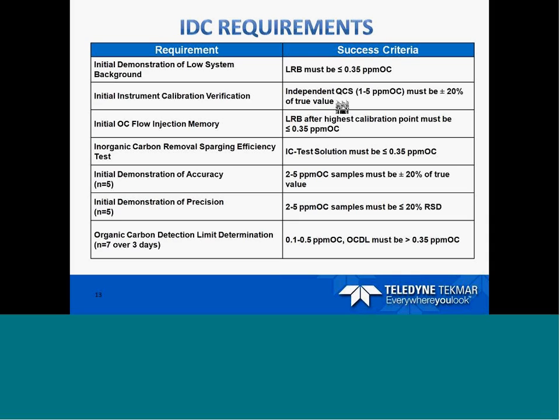We're going to get the demonstration of accuracy. We're going to look at precision, and also look at the organic carbon detection limit determination.